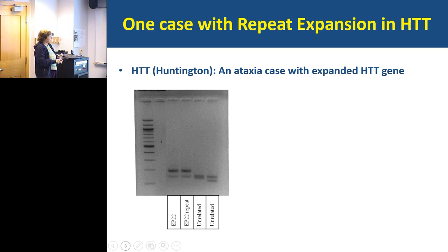So we molecularly looked at the HTT. These are unrelated individuals, and these are two repeat extractions of the same patients where Bo saw the expansion, and you can clearly see that there's one allele that's much larger than these. And we can actually gel purify this and sequence it and figure out how long it is.